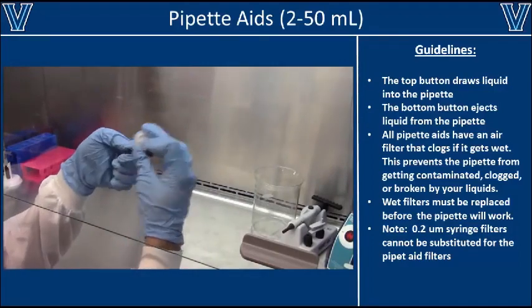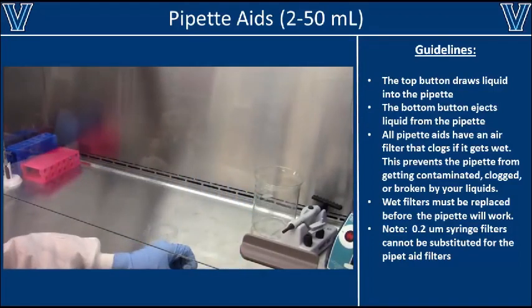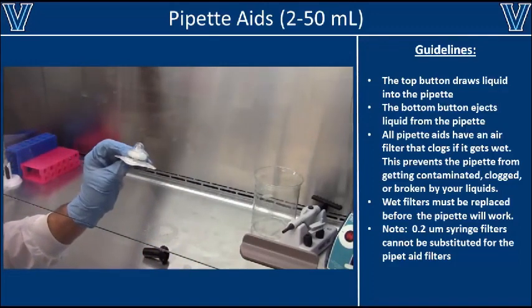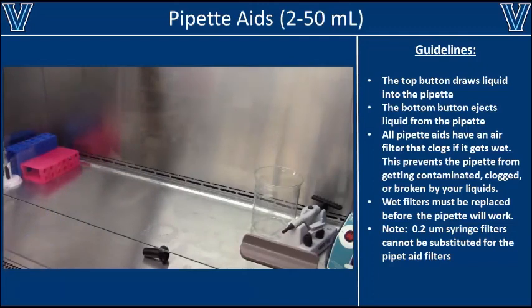Once you've removed the clogged filter, you'll need to replace it with a new filter. Note that syringe filters designed for liquid will not work properly in a pipette aid. You must use the air filter specifically designed for your pipette aid.